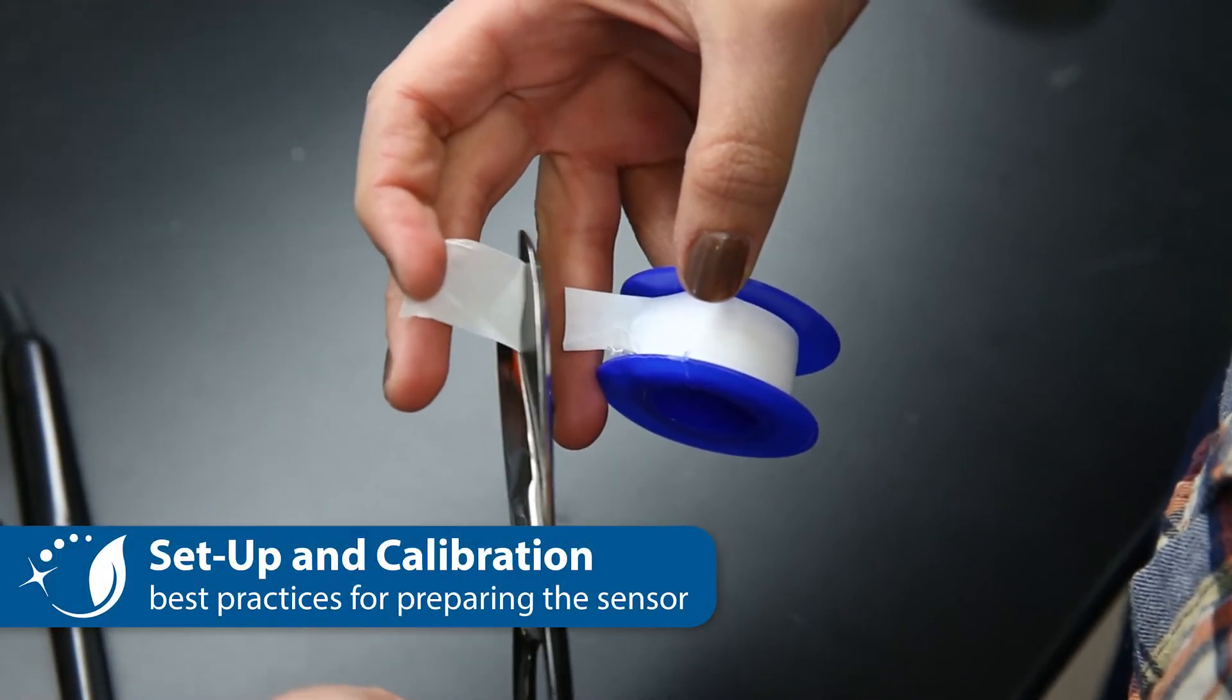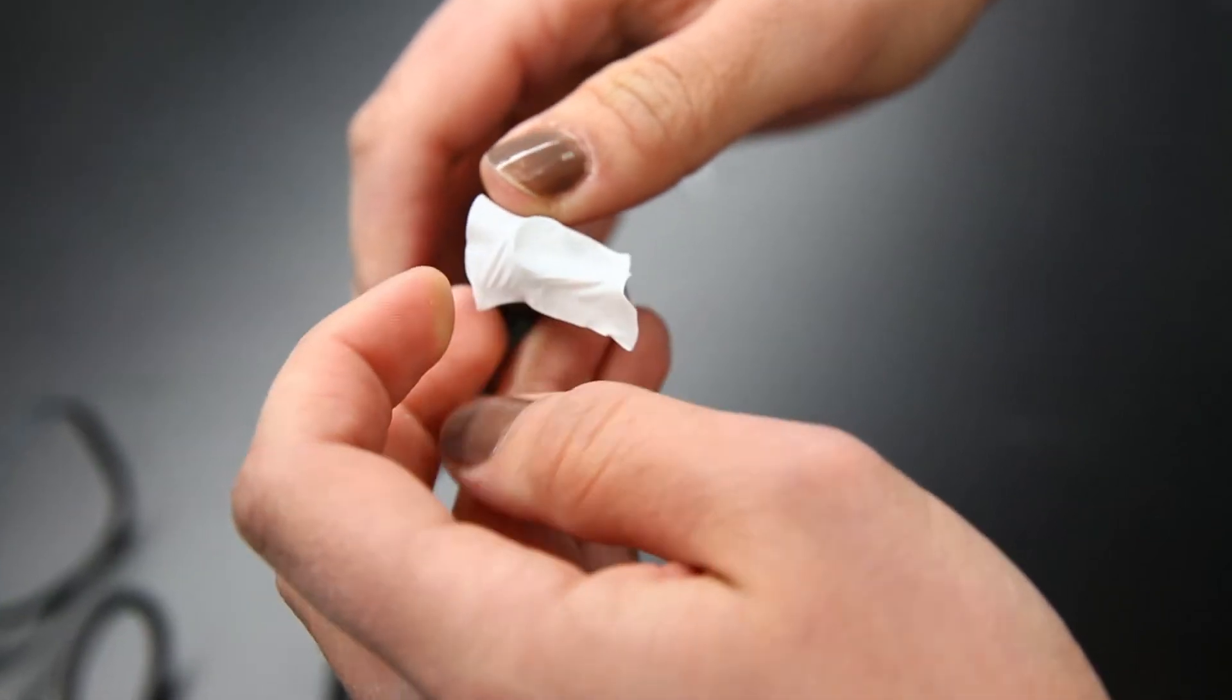Between each class use and before calibration, try to replace the permeable membrane on the end of the probe.